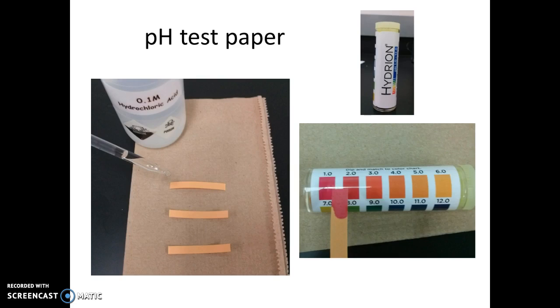The next test is similar to the litmus test but uses pH test paper, which comes in a small vial and starts as a light orange color. Arrange three strips on a paper towel and add a drop of each solution onto the paper. Compare the resulting color to the chart on the side of the bottle — a strong acid appears red and a strong base appears blue.